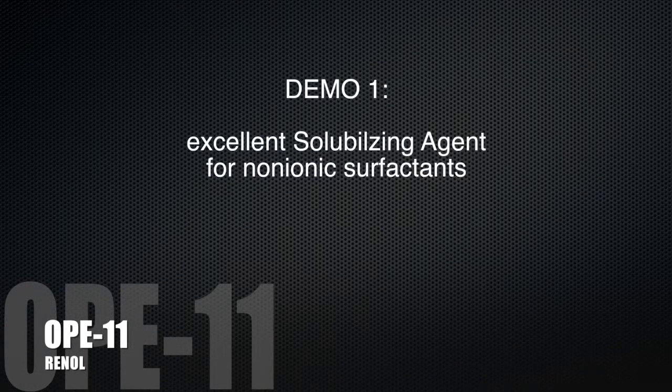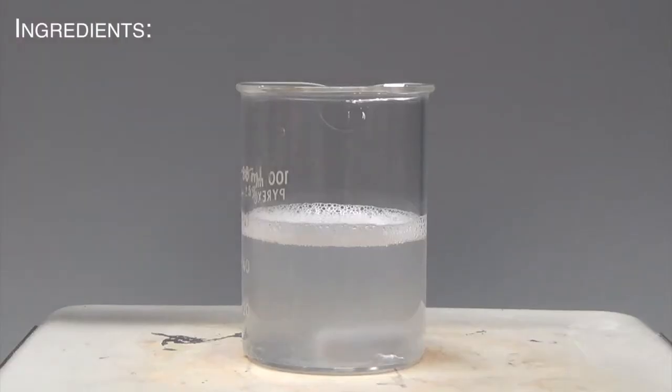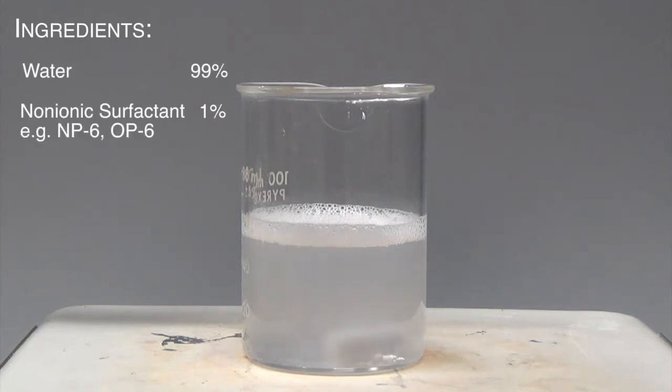Renal OP11 is an excellent solubilizing agent for nonionic surfactants. In this demonstration, we'll make up an aqueous solution with 1% of nonionic surfactant, for example NP6 or OP6.